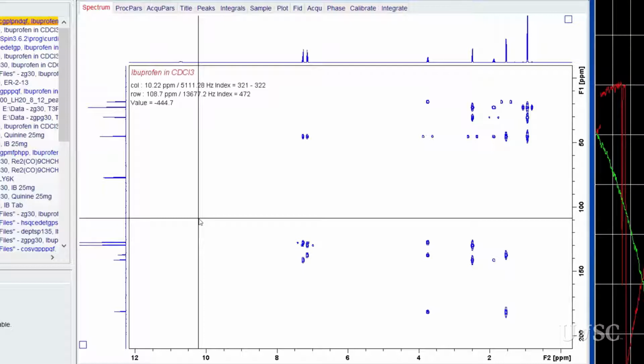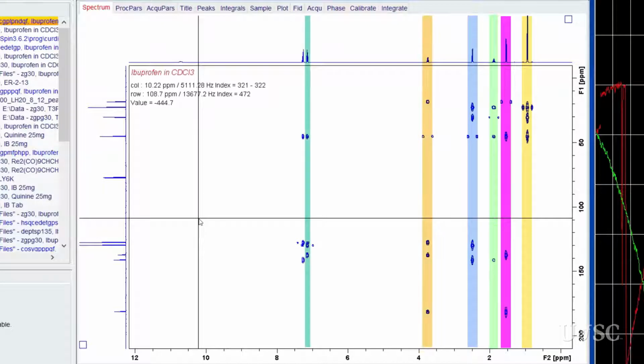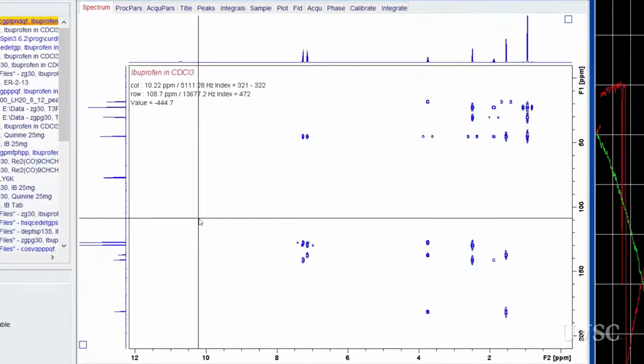As you can see, even for this relatively simple example, there are many cross-peaks scattered throughout the 2D spectrum. The easiest way to start interpreting the result is to examine the columns for each proton chemical shift and identify the C13 with which each cross-peak shows a remote coupling. Remember, these correlations are typically 2 and 3 bond couplings.